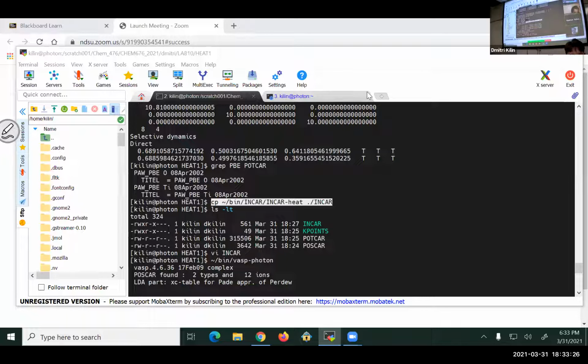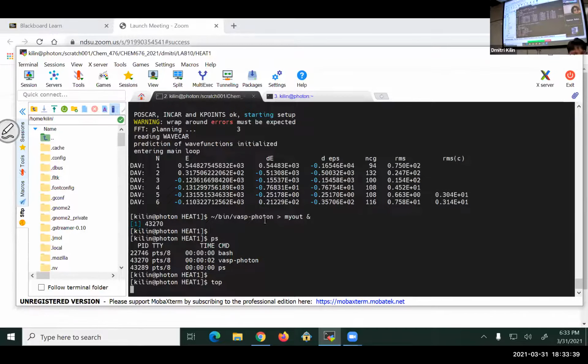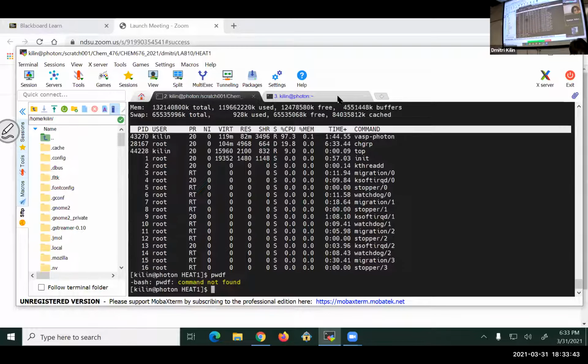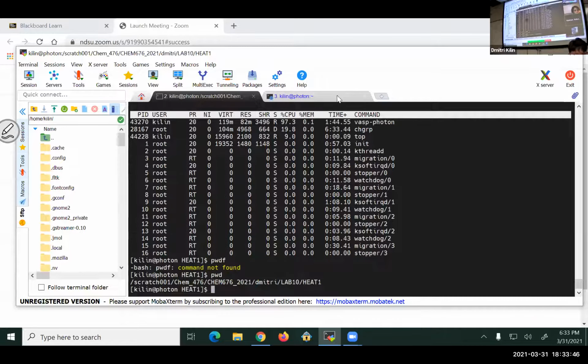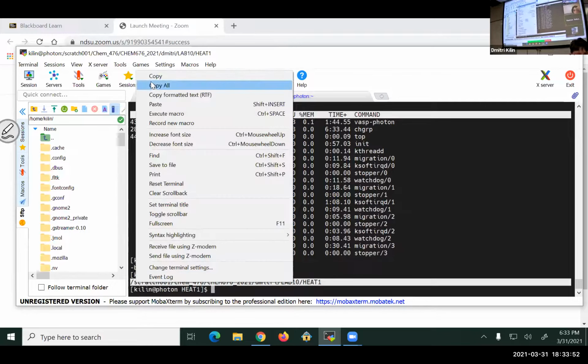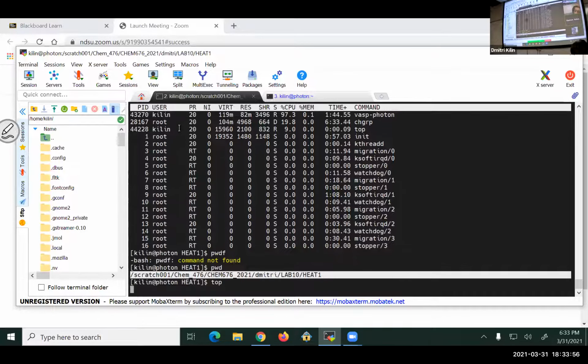Now, I do PWD and learn where I am at the photon. Copy this.